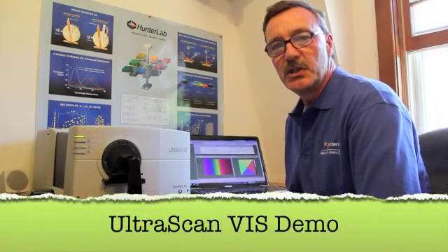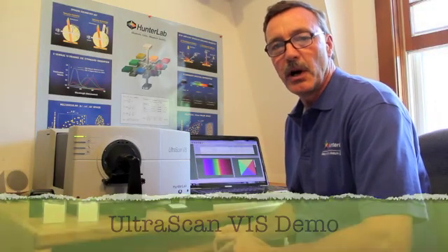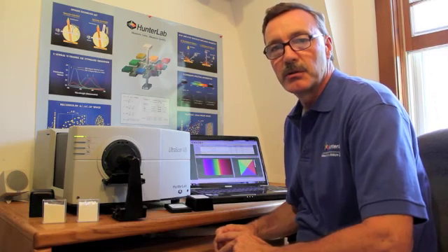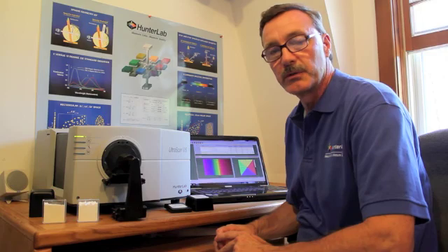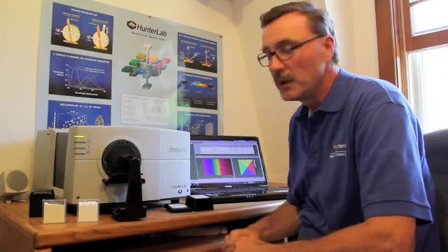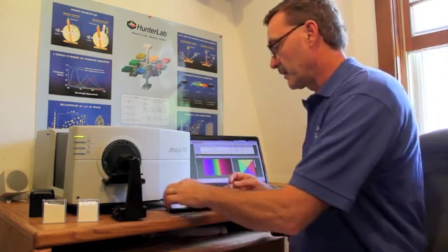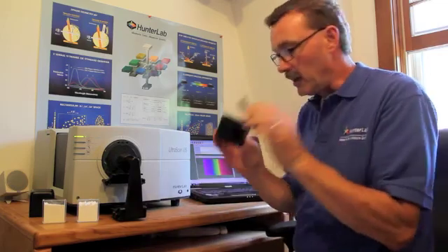In this demonstration, we'll be measuring the reflected color of powders. Powders are a very common application for HunterLab, measuring color in reflectance. First we standardize the instrument. I use both the black and the white tile.